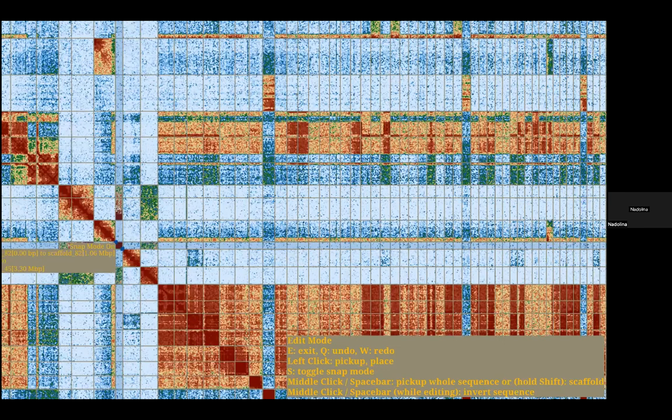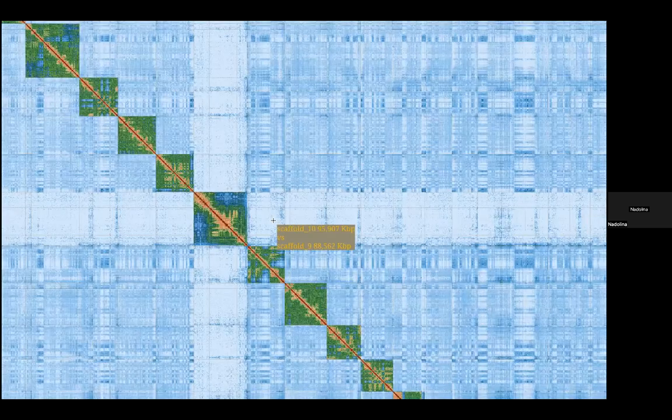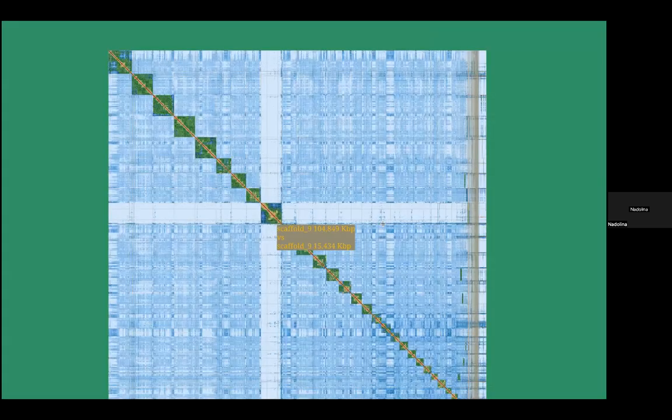So for instance, you could do this one. That one moves right in there. This one as well. You follow the signal, it goes there. And again, up here, you'll be able to just see that signal a little bit better and see where it fits in. So if we're following along, where does that go? All right, it looks like it goes here. So it looks like it actually goes into our X chromosome. So that is that.